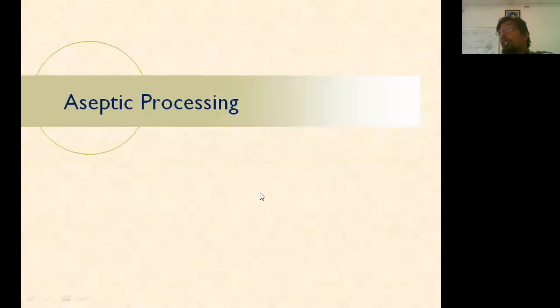Yeah, we are going to start aseptic processing. What is aseptic processing? I already said to you, a means without. Septic means without sepsis, without an infection. So a processing in which you don't give any chance for bacterial contamination or bacterial growth or any sort of infectious pathogen, bacterial or viral growth, is basically called aseptic processing, right?